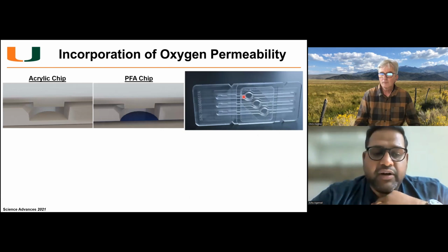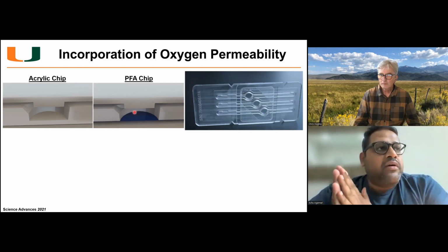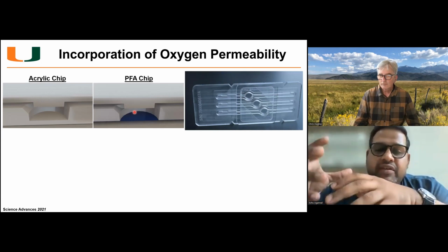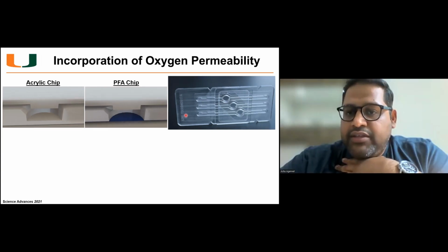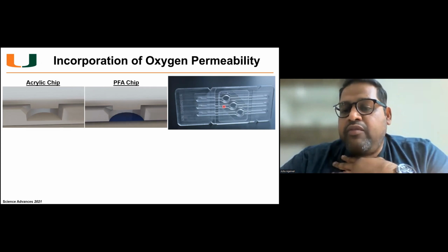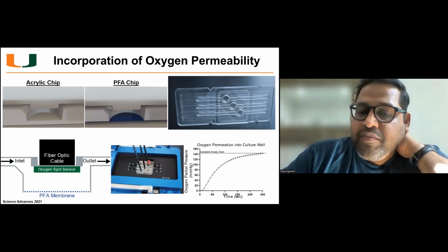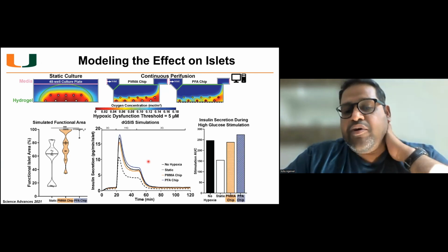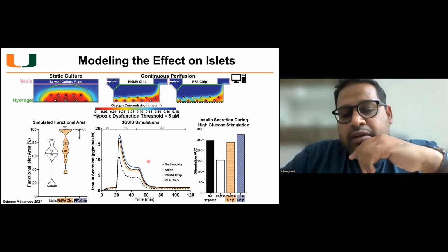Or a local supply of oxygen, if you build in, either through bringing more oxygen through the fluid, but in our case, we have a parallel or an independent source of oxygen just from the floor, from the bottom of the device. So because we machine everything, we can make a throughcut at the bottom and stick on an oxygen permeable membrane on the bottom. And with this oxygen permeable membrane, we would again solve the oxygen permeation or the diffusivity equation, verified by inline oxygen sensors. And once we're happy with the flow parameters and the local availability of oxygen as predicted by computer simulations.